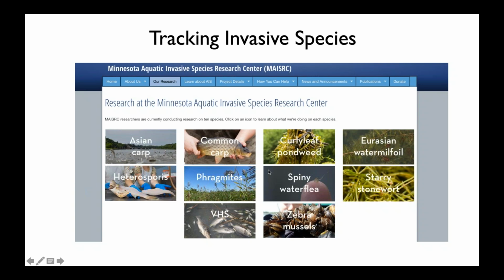And now we can actually do a broad assay for many invasives more rapidly than what we could do with just a PCR-based approach. More importantly, we can actually use that information and that data to provide a database. So now we have a basis to go about looking at different population structures potentially as well, as we have multiple invasions moving throughout these lakes.